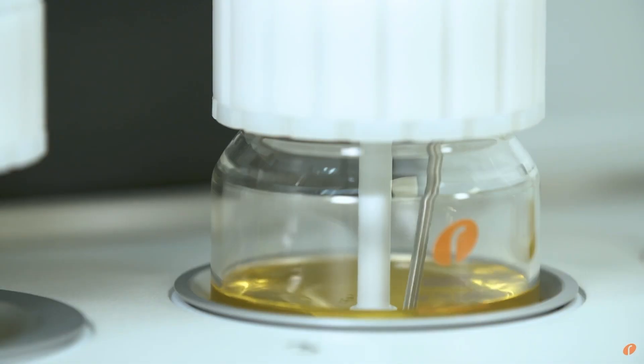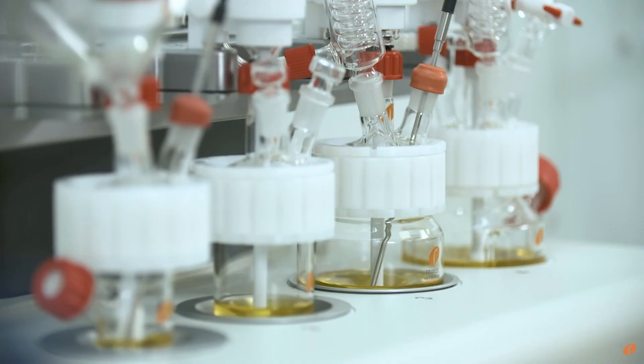A lot of systems come with just magnetic stirring and a little bead in your flask. The issue with that is, for our product, it causes degradation and you destroy the end product. So we needed overhead mixing.